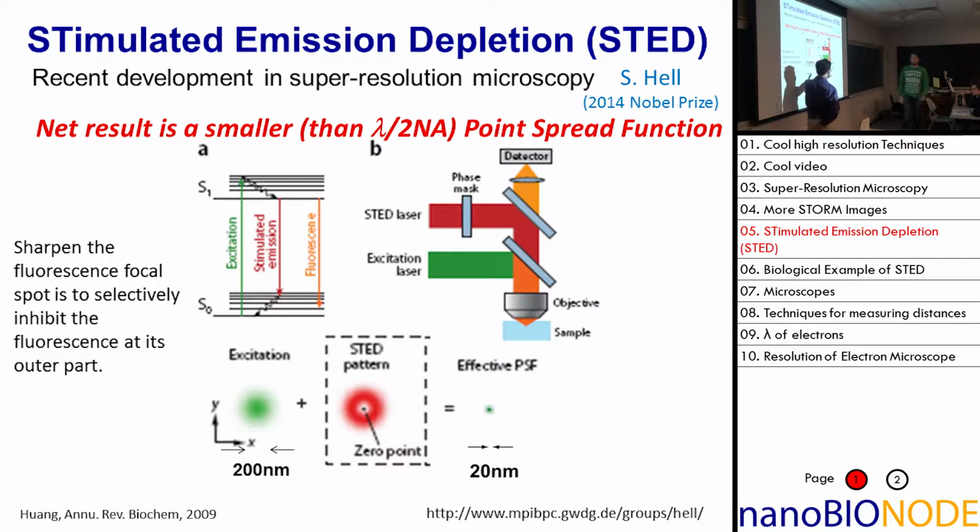Okay. Just stay there. So the two mirrors, you're talking about these? Okay, and what do these do? So just start again. What we thought is that this bottom mirror focuses the two lights together onto the sample through the objective. And then up through the detector, this top mirror is filtering out, through some mechanism, the combination of the excitation laser and the STED laser, so that you get this effective PSF of just the center of the excitation laser.